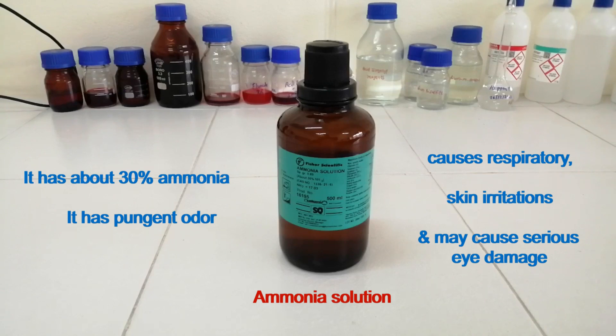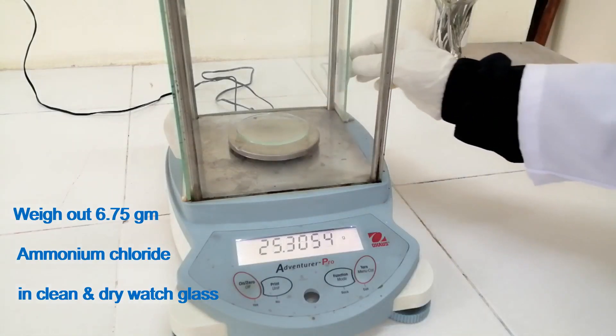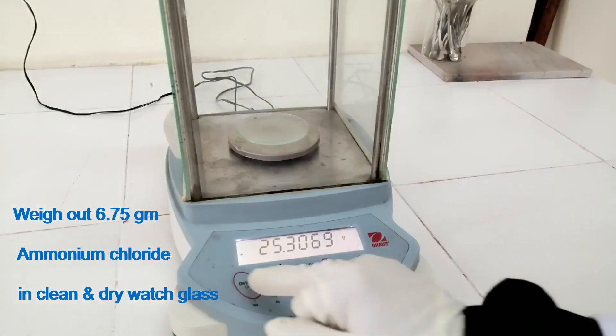It has pungent odor and causes respiratory and skin irritations and can cause serious eye damage. Weigh out 6.75 grams of ammonium chloride in a clean and dry watch glass.